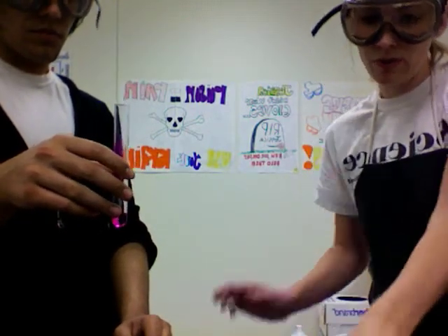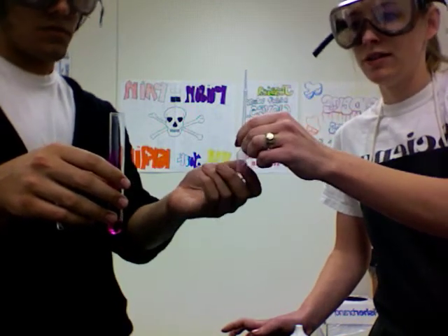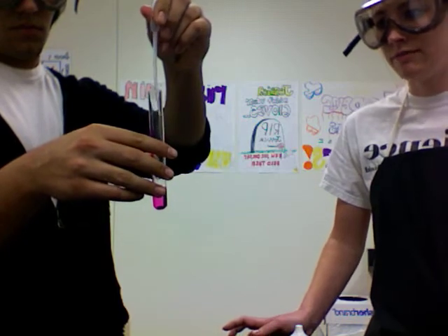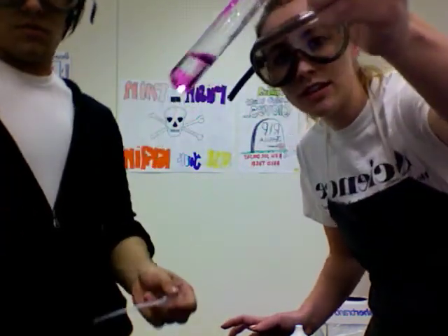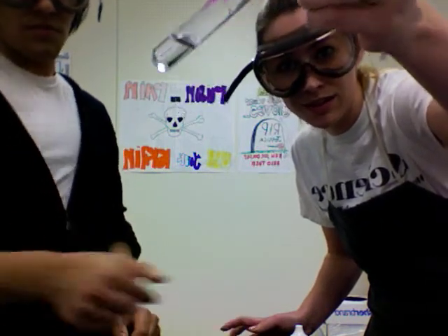Now what we're going to do is add enough hydrochloric acid to where the pink goes away. You can see that the pink on the side went away entirely. And as we shake this — it's not pink anymore because it's not a base anymore.